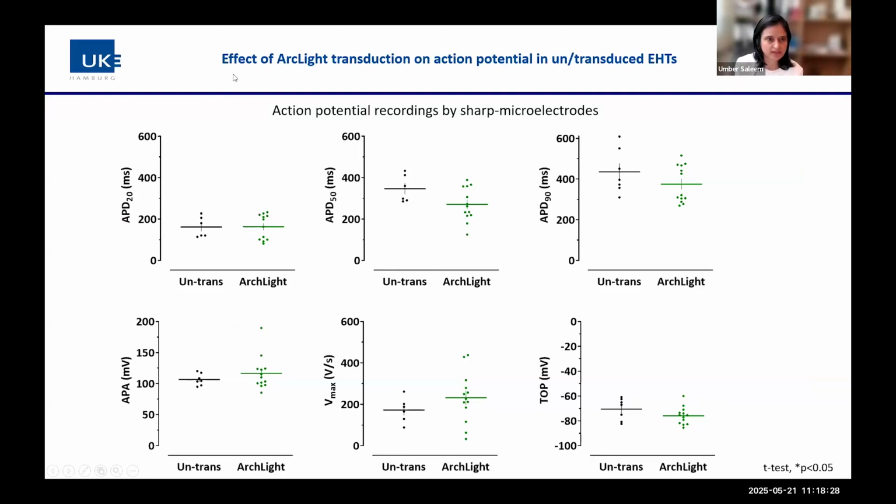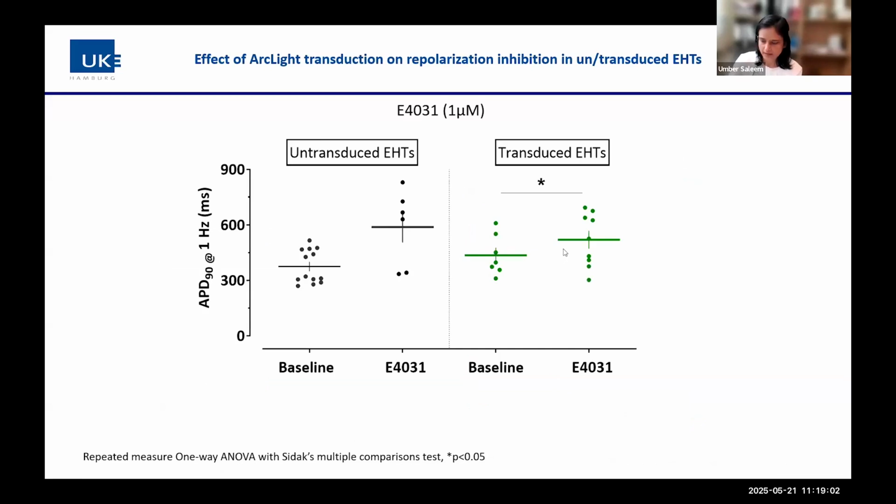And then we determined the effect of ArcLight transduction on action potential in untransduced and transduced EHTs by performing action potential recordings with sharp microelectrodes. And we do not see any change in untransduced and ArcLight transduced tissues in terms of APD20, APD50, APD90, action potential amplitude, Vmax, and takeoff potential.